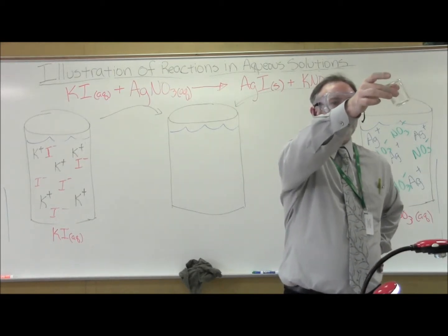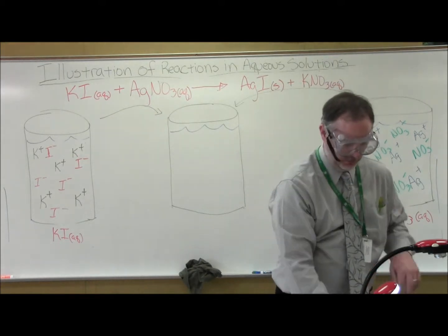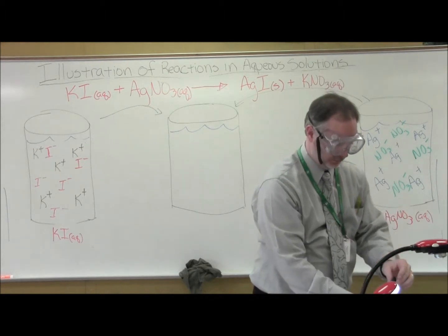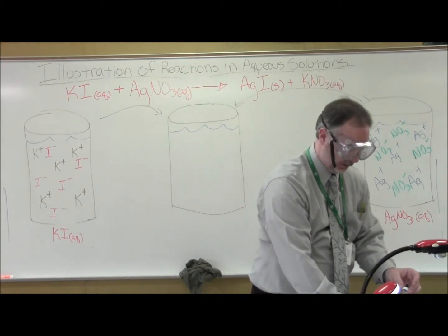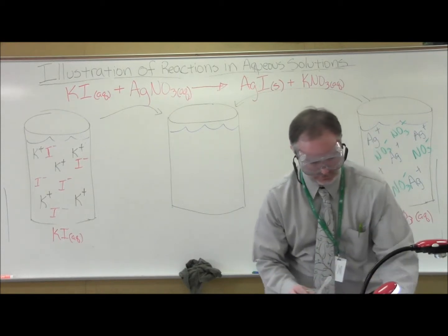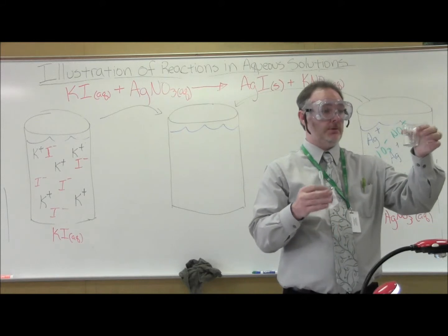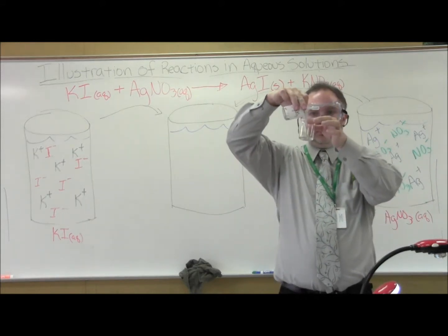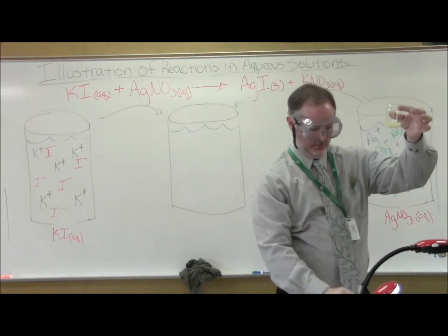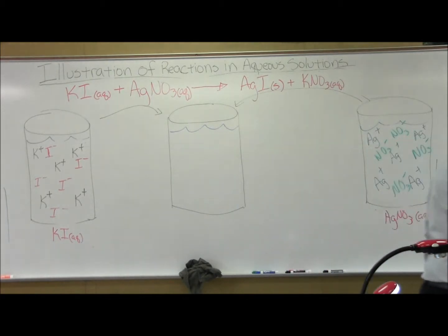All right, so there's potassium iodide, a clear liquid, and I keep it in the frosted bottle for as long as possible, because this eyedropper's broken. So I've got to go here first. Okay, something's supposed to happen. Whoa. It's yellow. And you see on the bottom there?